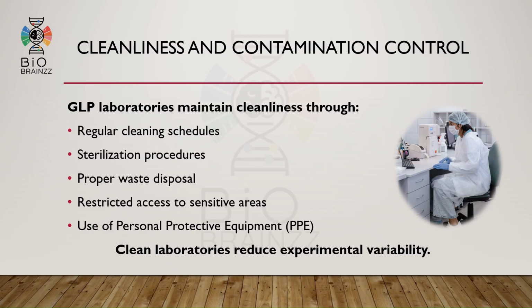Cleanliness is one of the core requirements of GLP laboratories. Even a small contamination can affect the entire experiment. To maintain cleanliness, laboratories follow regular cleaning schedules, sterilization procedures, proper waste disposal, restricted entry to sensitive areas, and PPE usage. Clean laboratories reduce variability and improve accuracy of results.